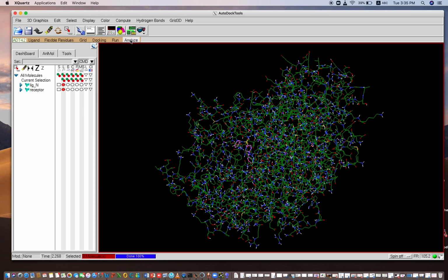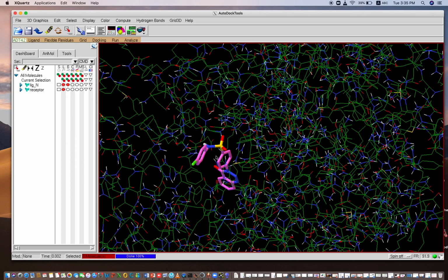First of all, I'll change the presentation a little bit, and here we are going to change the ligand. This is the ball arrangement. Yes, this is a little bit better. So this is our ligand now.